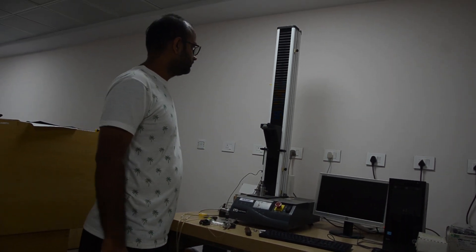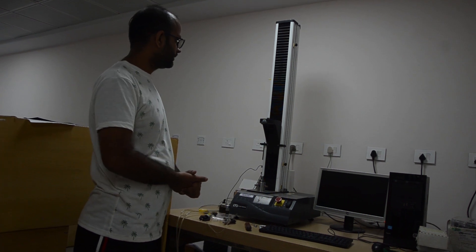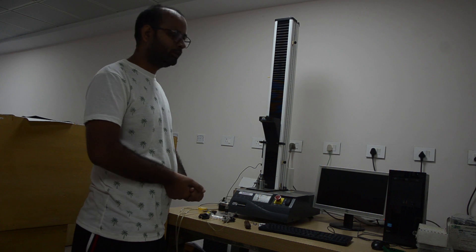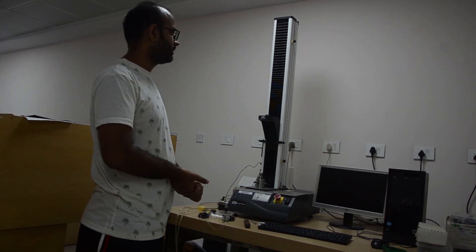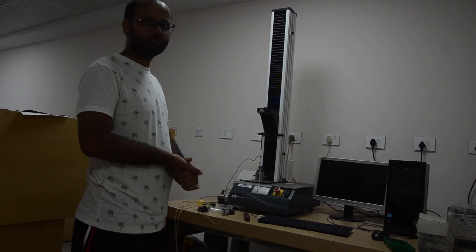This is a single column UTM — Universal Testing Machine. We are going to do tensile testing for a single fiber. It is a single column machine especially made for precise tensile testing.